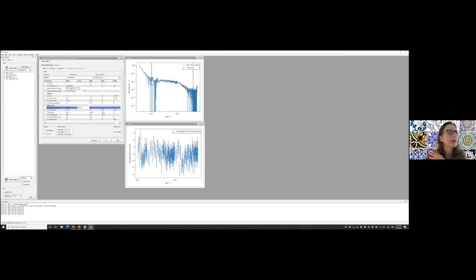For now, I'm just going to click here on the left panel on the Data Explorer. If you open the option for your data, I'm just going to click unselect all so that nothing's clicked by mistake. You can see that now you have fit results in here. So you have this M1. M1 is basically the curve for your fit. And you have the PFQ, so your form factor, and your SFQ, so your structure factor that we've just fitted. And if you want to look at what that looks like, you can click on this SFQ option. And you come to the bottom here and you say create new plot. And it will show you a plot of your structure factor.